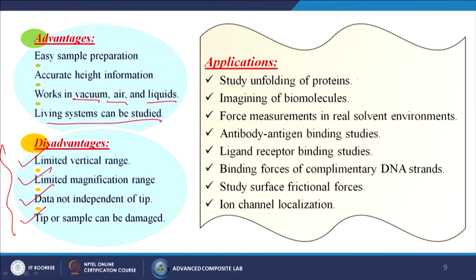What are those? Study unfolding of proteins, imaging of biomolecules, force measurement in real solvent environments, antibody antigen binding studies, ligand receptor binding studies, binding force of complementary DNA strands, study surface frictional forces, ion channel localizations.